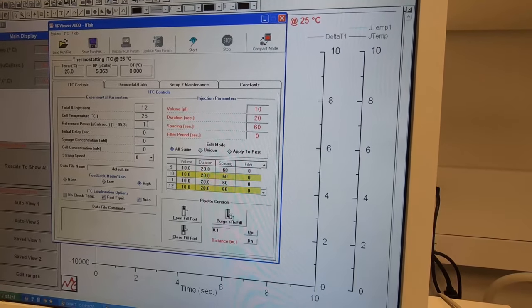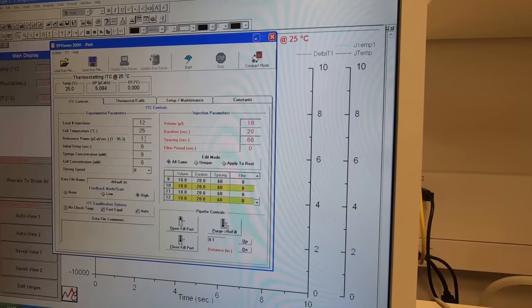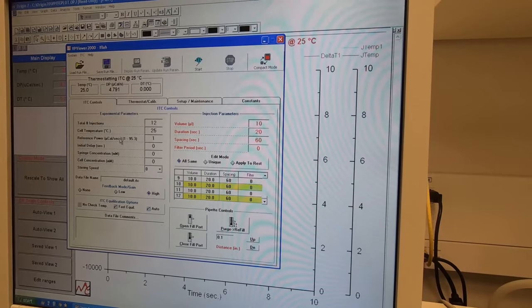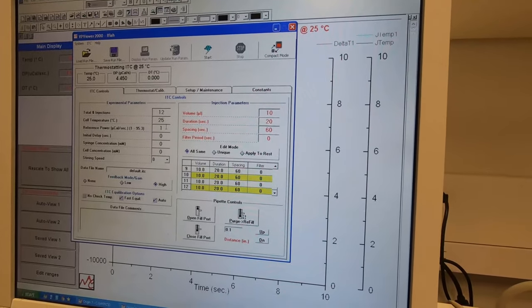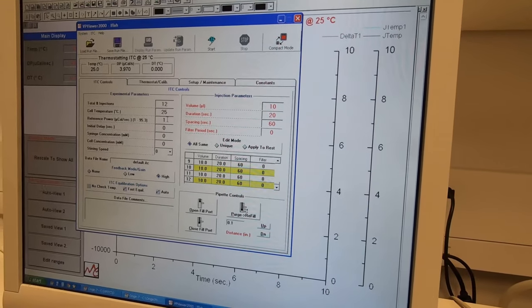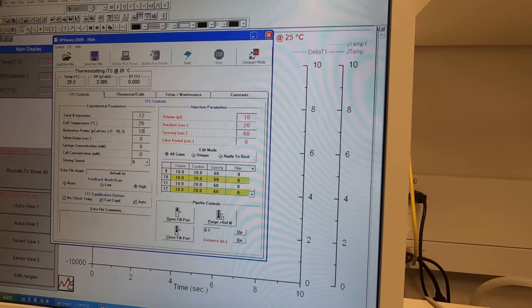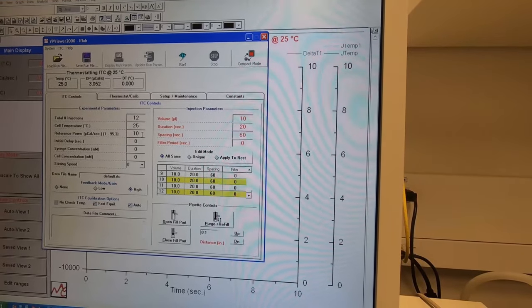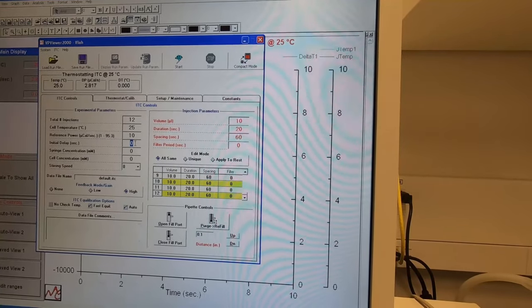The reference power defines the starting point of the data in the ITC. This depends on your sample and the type of binding you are studying — whether it's exothermic or endothermic binding — as you will need different starting point values. After you subtract the reference data, it will be fine, so you don't need to worry too much about reference power. Usually keep it somewhere between 10 to 20. Make sure the reference data and your binding data use the same reference power so there are no issues when you subtract.